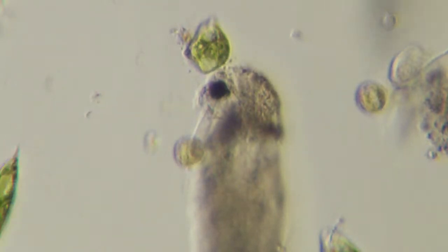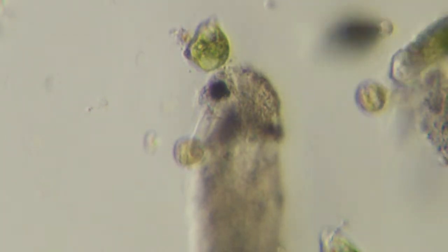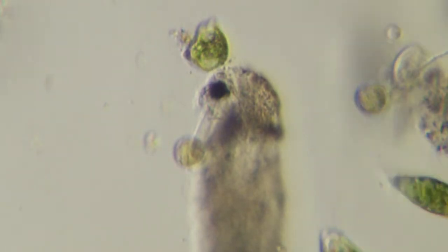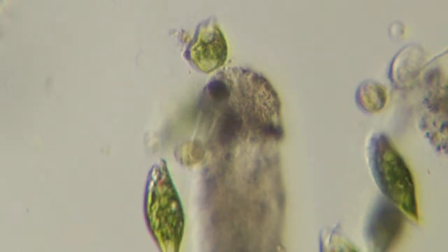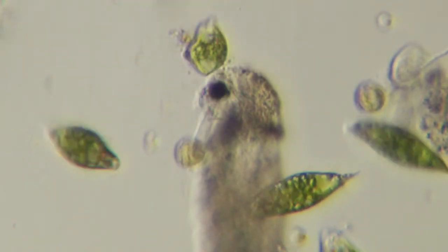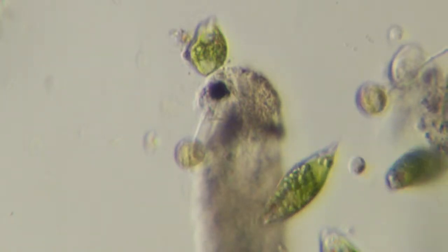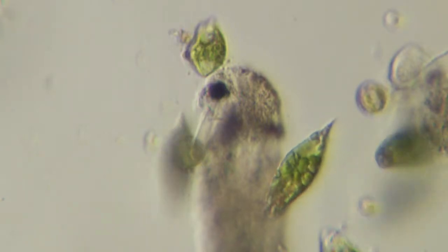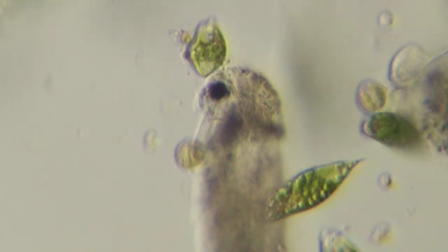These guys are all out of focus. There you go. See, it pops in and out. I put a little extra water on the slide by accident, so they have too much Z to move in. The depth of field is so shallow at this magnification, it's really hard to maintain the focus. But look at them twirling as they cruise by. That's so cool. There you can see the chloroplast on that one as it rolls. There's a lot of 3D structure there.